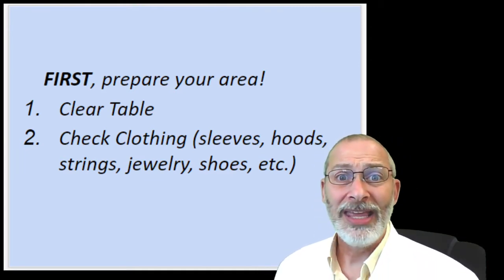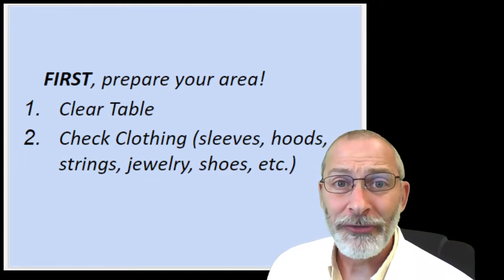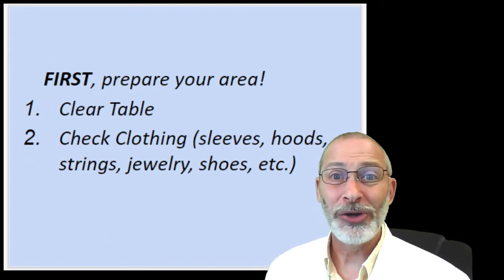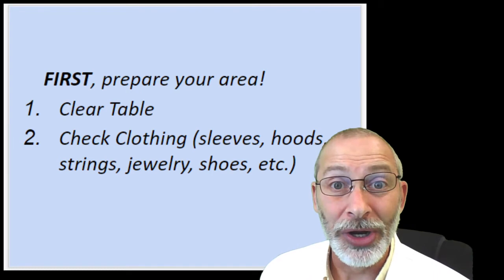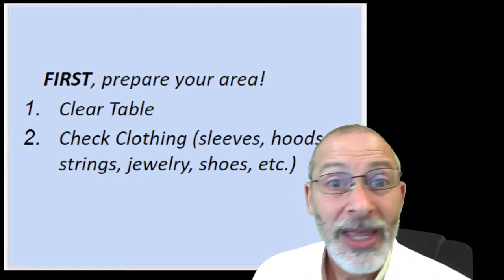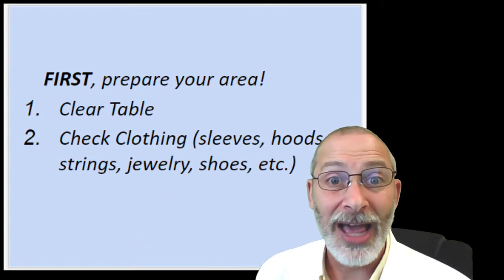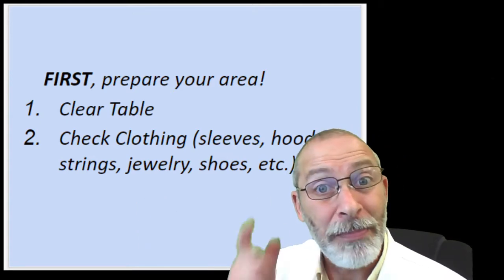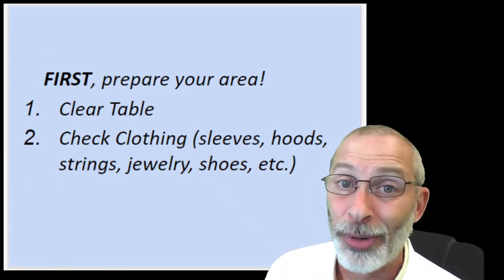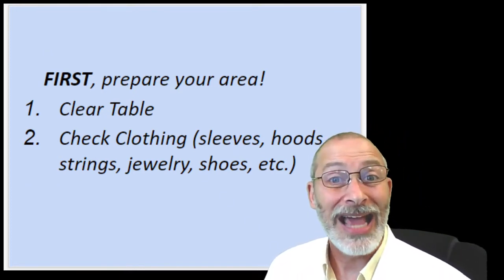Number one, it prevents your peripheral vision from helping you out. You don't want your view obscured. You're working in a laboratory with lots of other people. If something is going on at a lab table nearby, you should be peripherally aware that there's a fire breaking out and you might need to get out of the lab.